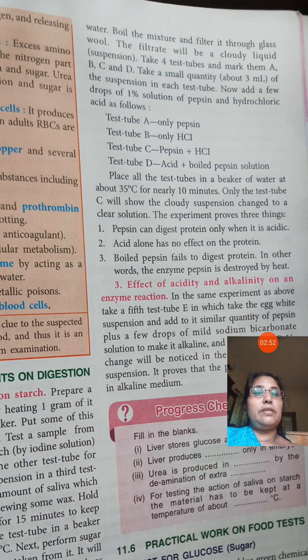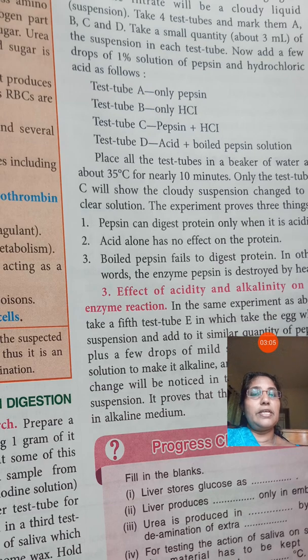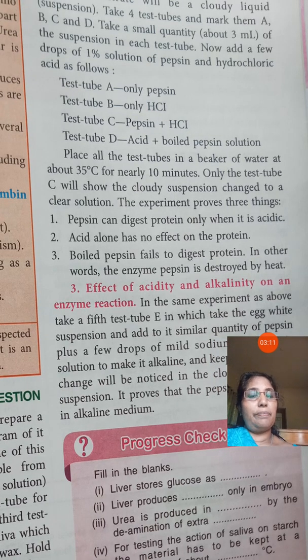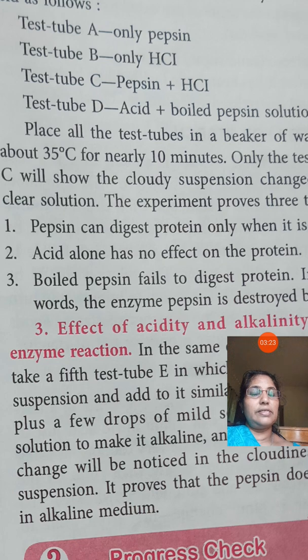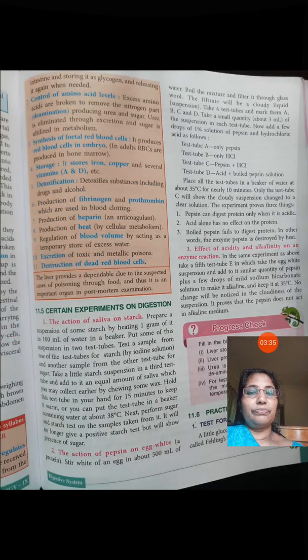We add a few drops of pepsin and hydrochloric acid into it, and keep it at body temperature, about 35 degrees Celsius, for nearly 10 minutes. Then after that we can see that the cloudy appearance of the egg white has changed into a clear liquid. That solution will become a clear solution. That shows that pepsin can digest the protein, the egg white, into a soluble form. Amino acid in the soluble form, it can change. That also we can understand.